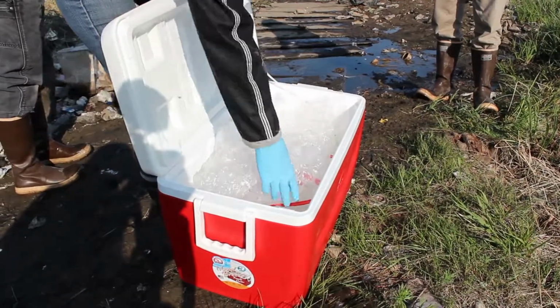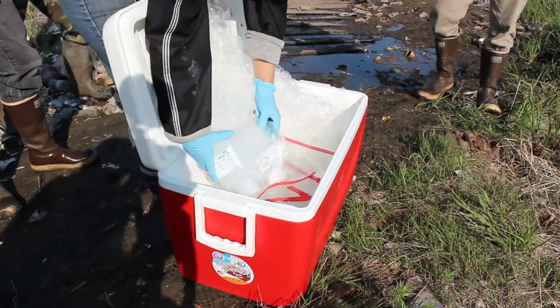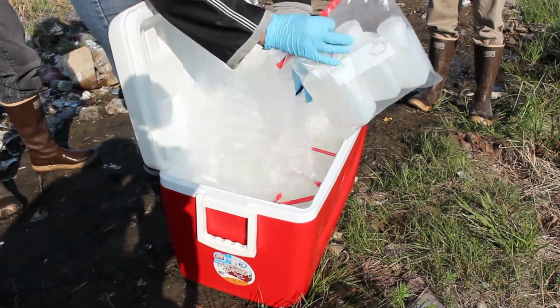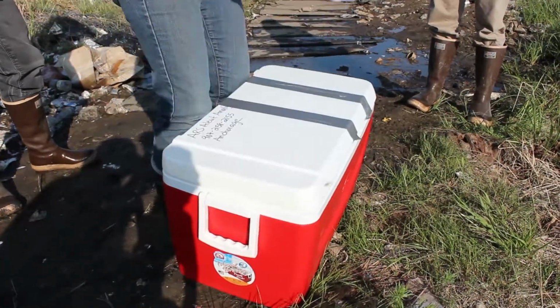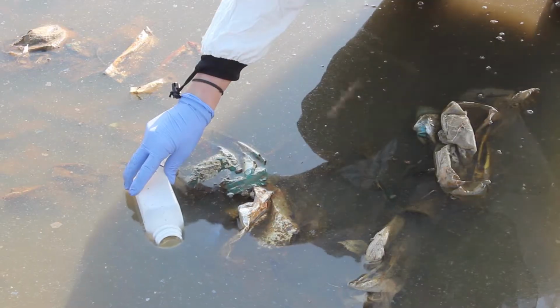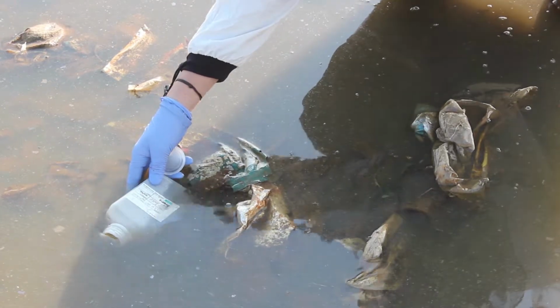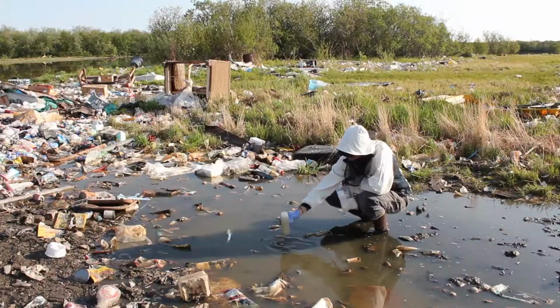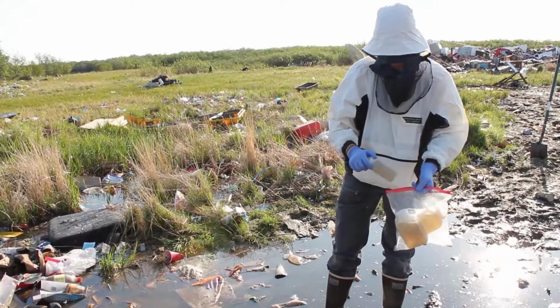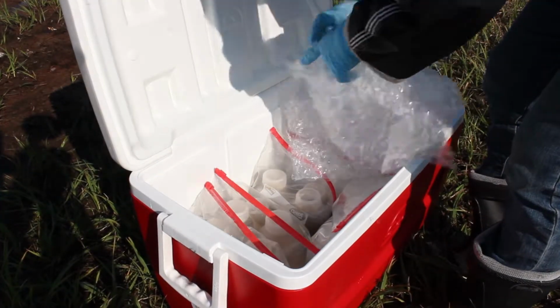Then collect water in the sample bottles that you will send to the lab for analysis. To avoid contaminating your samples, do not touch the inside of the lid or the rim of the bottles. Gently place the bottle into the water and fill up to the line shown on the bottle. Be careful not to disturb the water too much. You don't want to collect too much mud. Once full, put the bottle in a plastic bag and place it in the cooler.